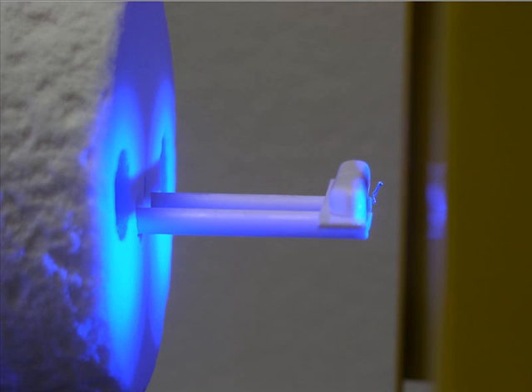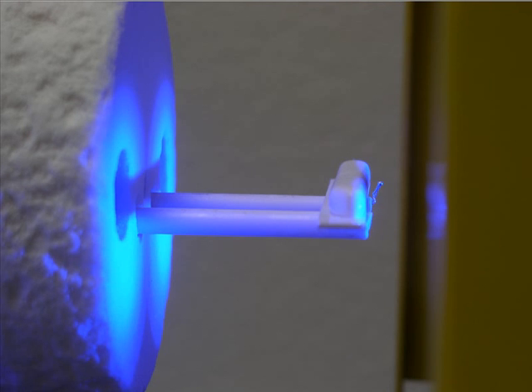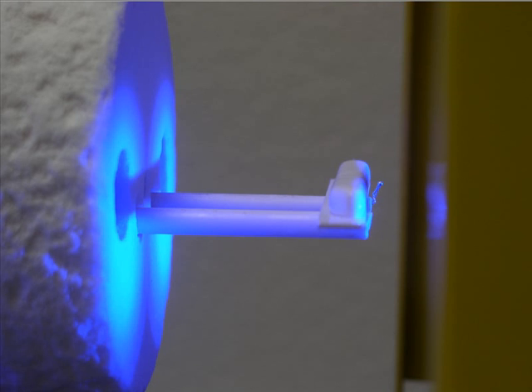Anyway, if the sample melts on the alumina plate there is no danger for the dilatometer. This is the main difference between the horizontal and vertical model. The sample of the HD model is set vertical and it is completely free to sinter.